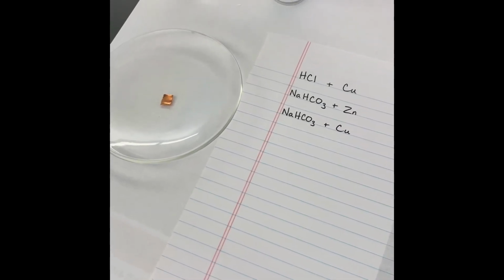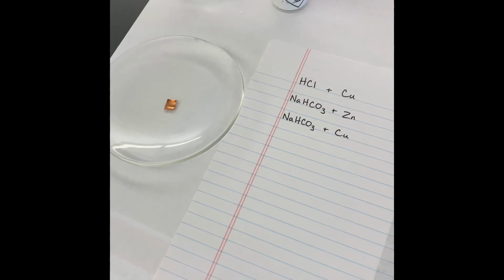We have our HCl, our hydrochloric acid, and a piece of copper foil.